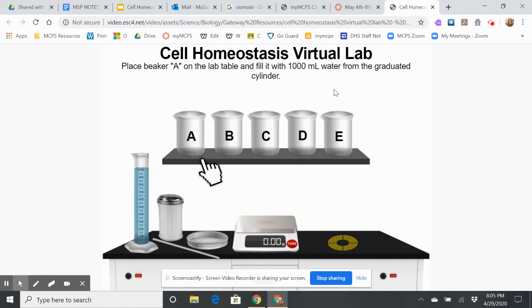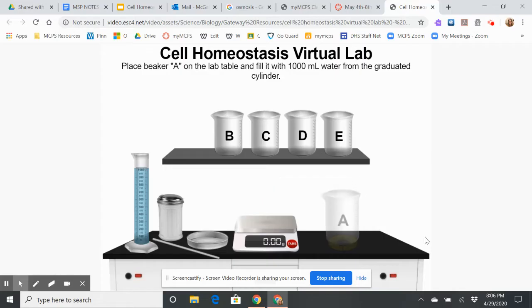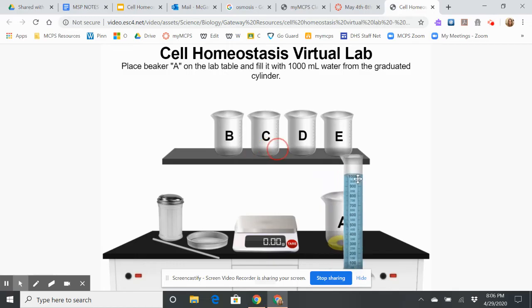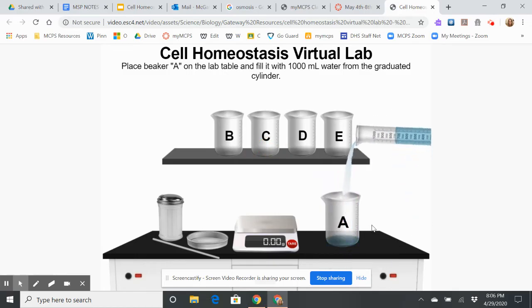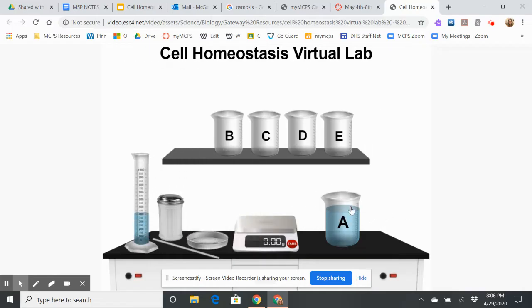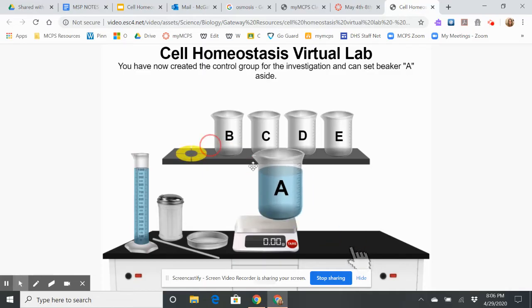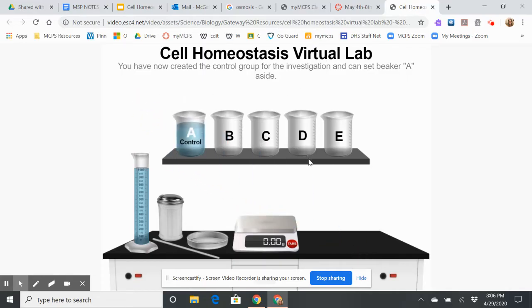You're going to drag these items. I'm going to put beaker A in place, and it tells me to fill it with 100 milliliters of water from the graduated cylinder. I just click and drag whatever it tells me to do. You've now created the control group for the investigation and can set beaker A aside. Remember that a control group is there for comparison.